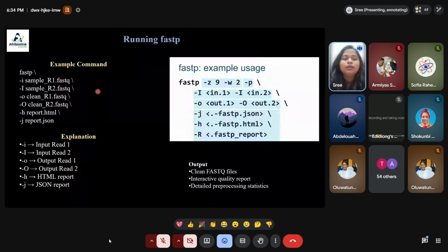So these are the outputs provided, which give the clean FastQ file, where the overrepresented data, GC content, and adapter content are removed. This clean data will be taken as input to perform the downstream analysis. That's why you are going to see, in the coming session on July 13 and 14, the next steps of the process and how to perform those analyses.